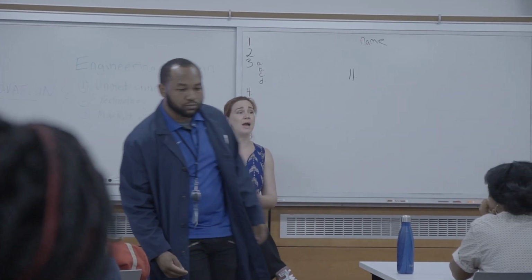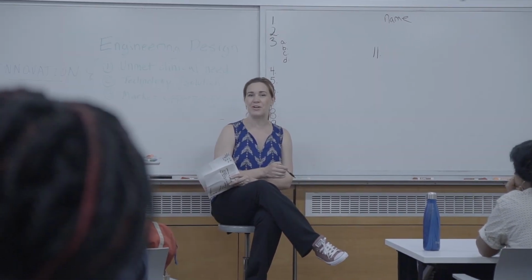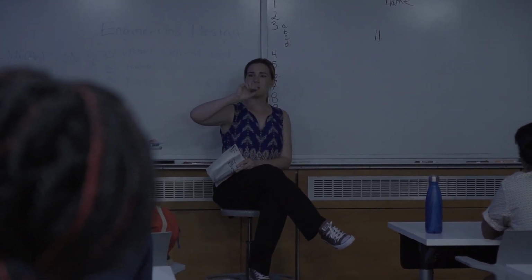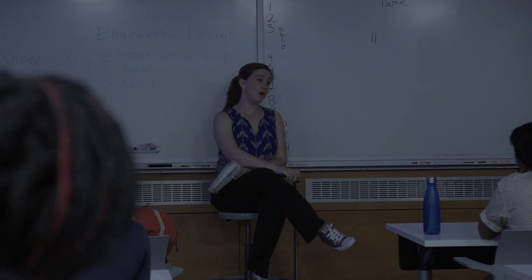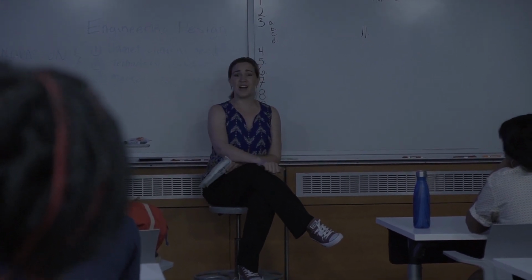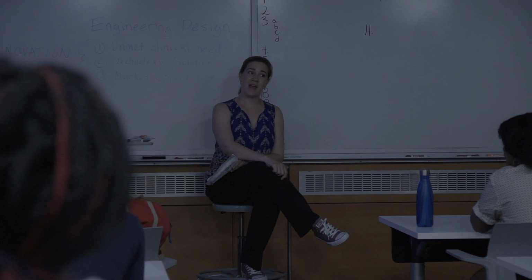Yeah. So sometimes, remember we said you have to be careful pipetting because you can mix up. Sometimes you don't have a pure template, so you might have a second template that got in there, so you're getting extra cuts or extra things you don't expect. Sometimes, and this has happened to me, you have a map and you expect the restriction sites in a certain place, and maybe whoever made that map or those sequences made a mistake, or at some point your DNA mutated and there became another restriction site. So you actually got a cut you didn't expect. I've definitely had that happen where I have 3 bands and I only expect 2.